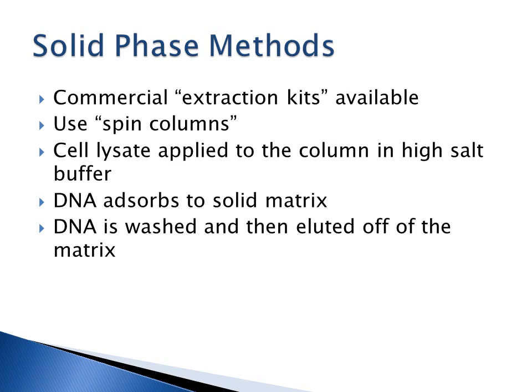There are also solid phase methods, and usually these are commercially available DNA extraction kits. There's many companies, Promega, Qiagen, numerous companies that sell these extraction kits.